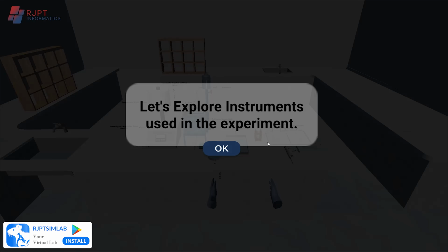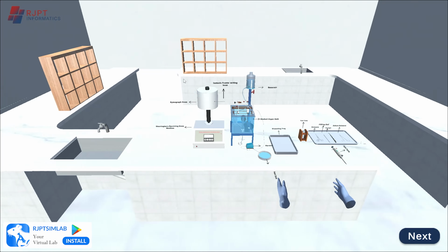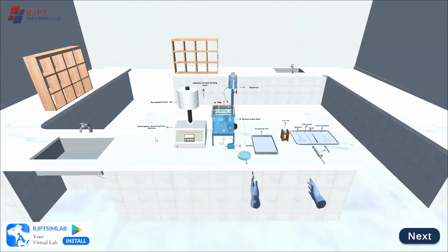For that, we will perform this experiment in our RJPT Simlab simulatory laboratory. As you can see, this is our RJPT Simlabs lab. From the movement of the arrow keys, we can move throughout the laboratory. And now let's discuss our instruments, which we will use during the experiment.